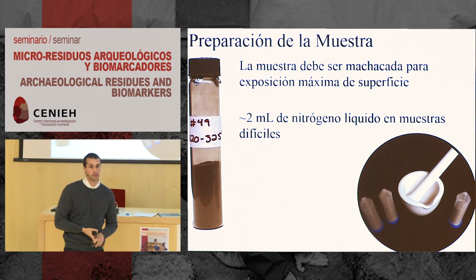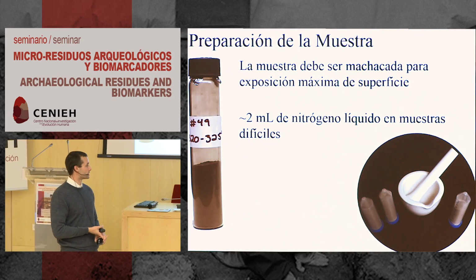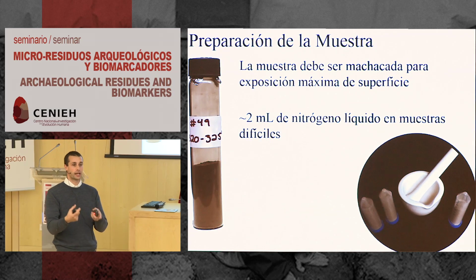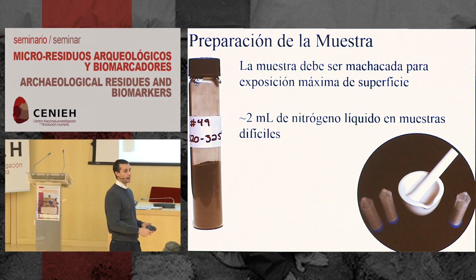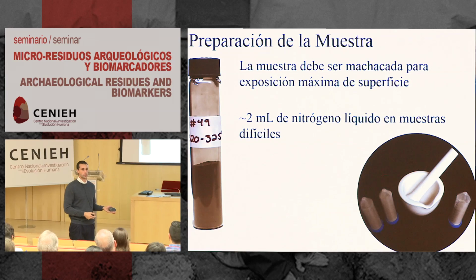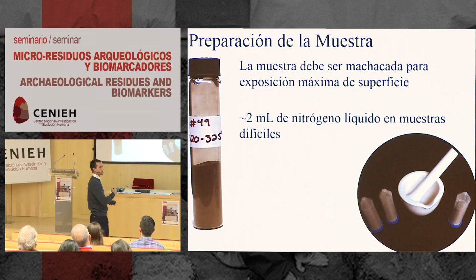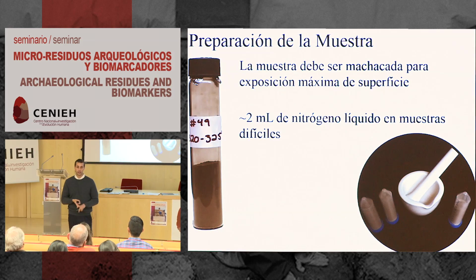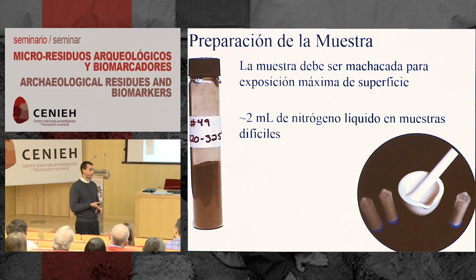For really difficult samples, like if you have modern bamboo, for example, I worked on a project, and this will maybe sound silly, but we looked at bamboo as it went through the panda's digestive tract. So we actually had to collect panda poop and analyze the panda poop for lipids. And they don't really do a good job digesting their food. So we'd often have to use liquid nitrogen. And just a little bit of liquid nitrogen will help for breaking up your sample. So if you do more modern material, liquid nitrogen, again, it doesn't really affect the biomarkers, the N-alkanes themselves. So it's always great for that.